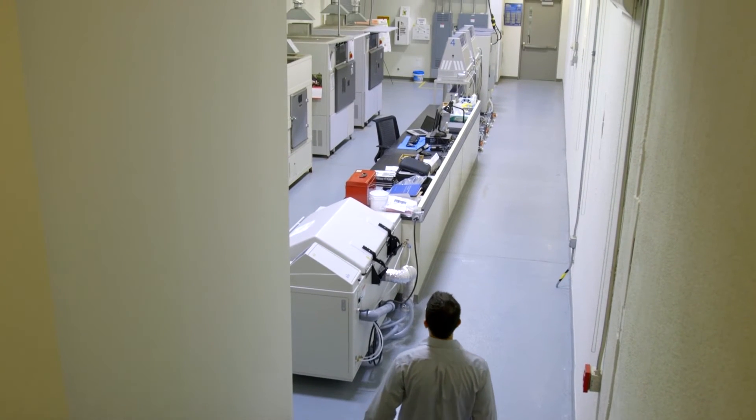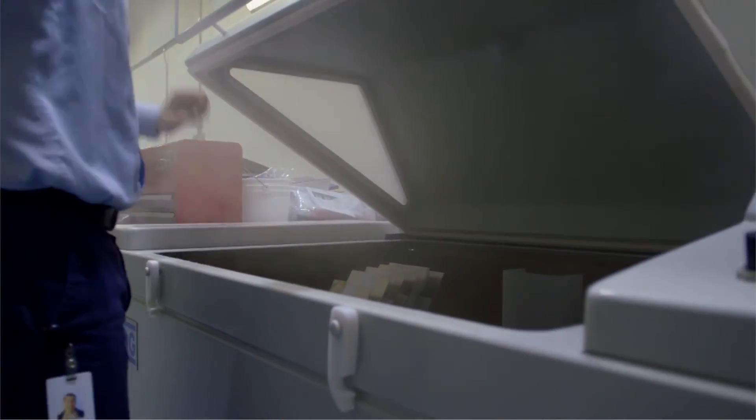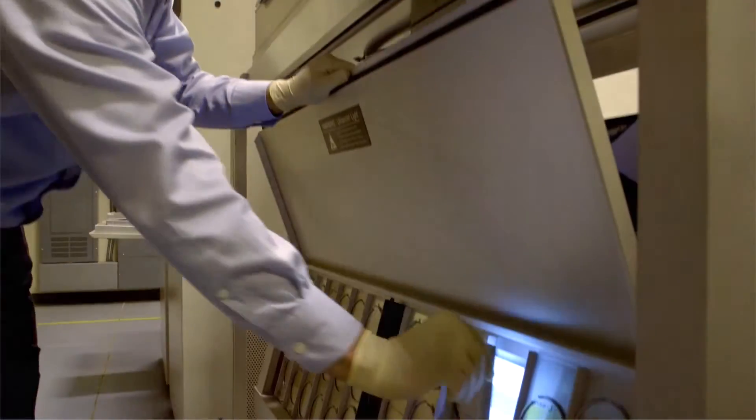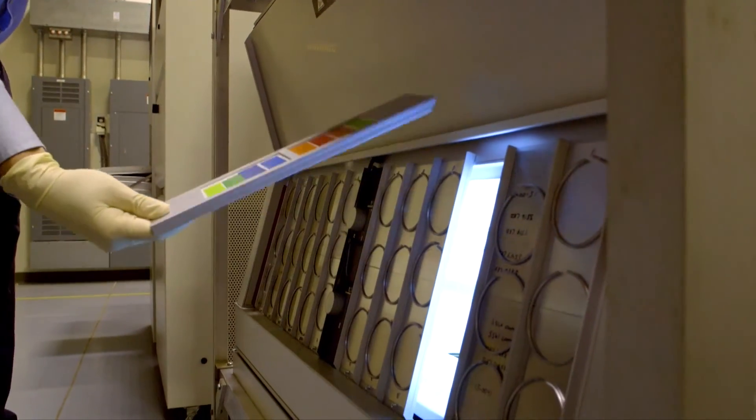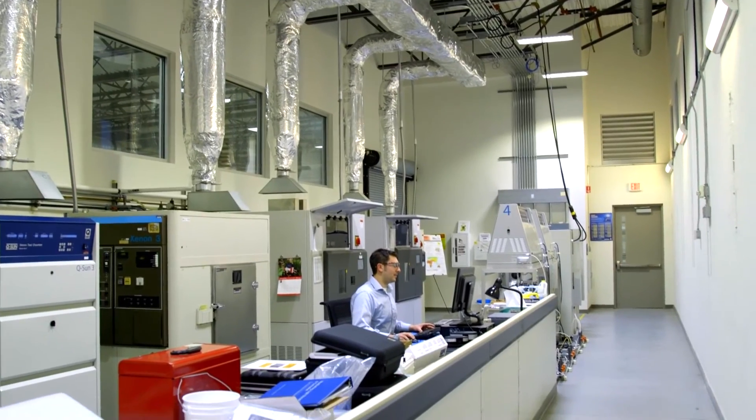The final stop on our Innovation Center tour is the durability and accelerated weathering room. Materials and constructions are tested in a variety of conditions, including salt spray, intense ultraviolet rays, heat, and desert light conditions. We gain information while pushing materials to their limits.